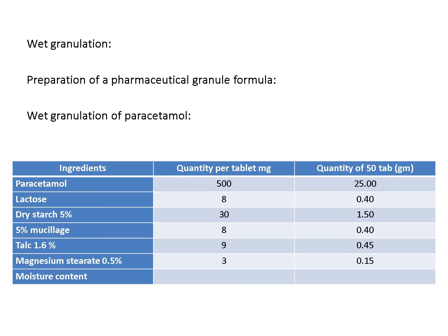It will be 15 milligram per 1 tablet inside the granules, and 15 milligram outside the granules. The most important part is the dry starch 5% outside the granules, the disintegrant, because if we don't add dry starch or disintegrant outside the granules, the tablet will remain intact.